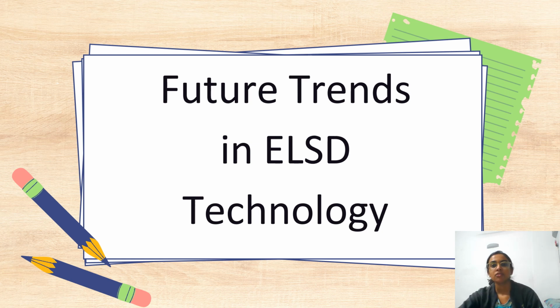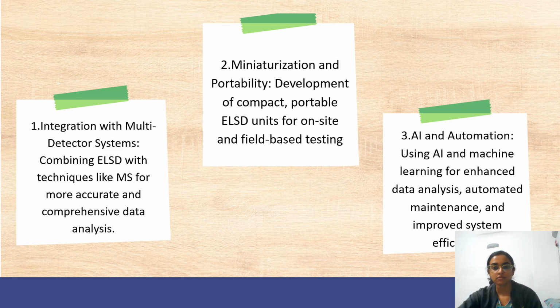Let's see the future trends in ELSD technology. First one is integration with multi-detector systems, combining ELSD with techniques like mass spectrometry for more accurate and comprehensive data analysis. Second is miniaturization and portability: development of compact, portable ELSD units for on-site and field-based testing.